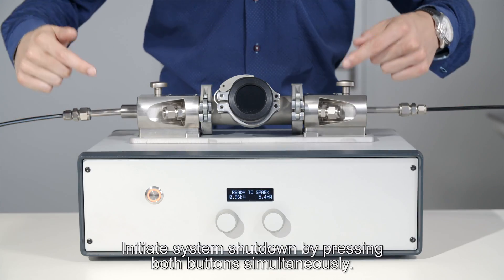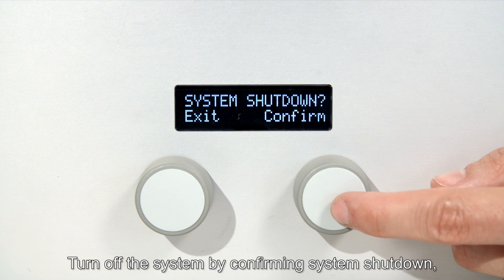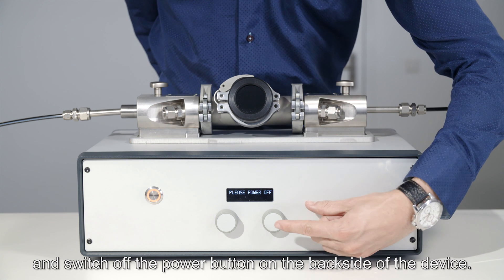Initiate system shutdown by pressing both buttons simultaneously. Turn off the system by confirming system shutdown and switching off the power button on the back side of the device.